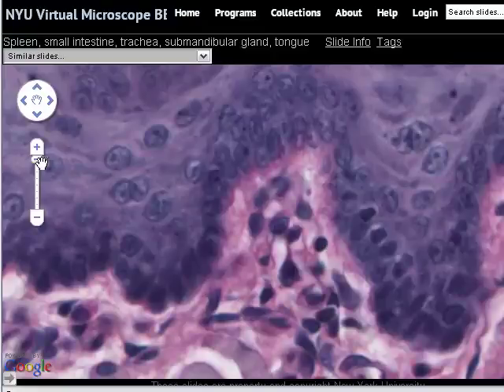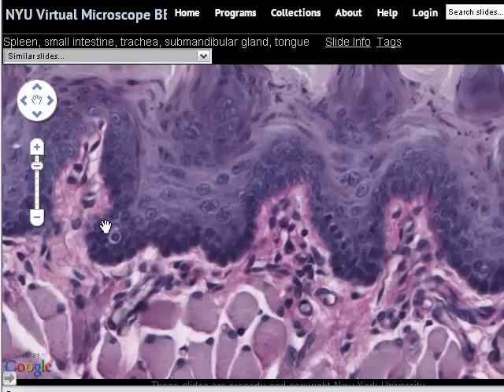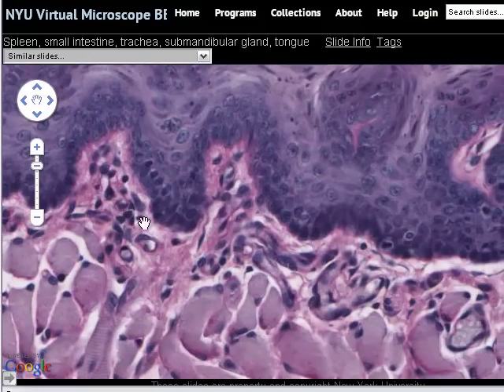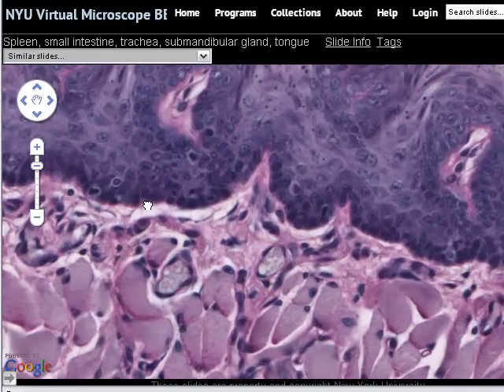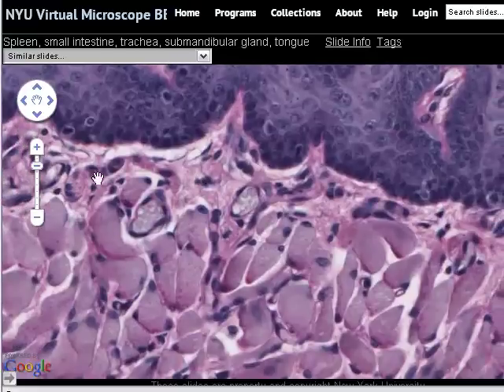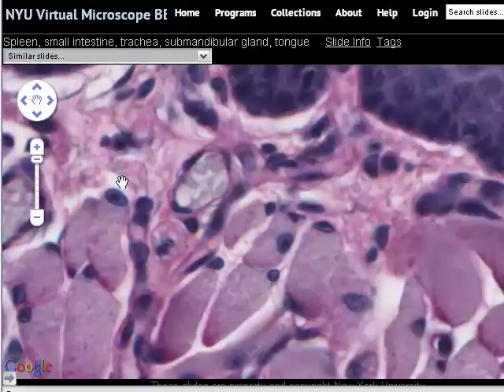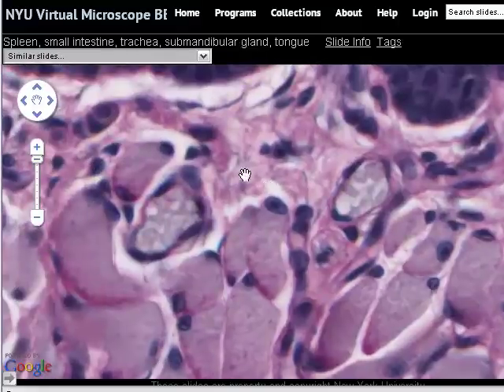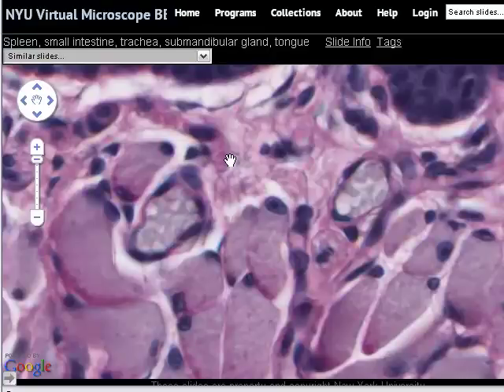One other reason to look at the tongue slide is that there are quite a large number of blood vessels present. We're going to zoom in to look at a couple — not primarily to teach you the appearance of blood vessels, but rather to look at a special type of epithelium called endothelium. This is the simple squamous layer of cells that lines blood vessels.